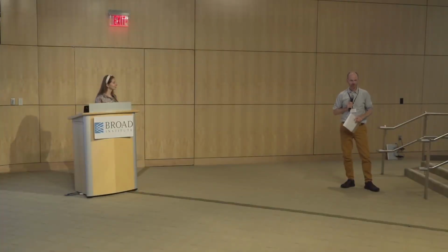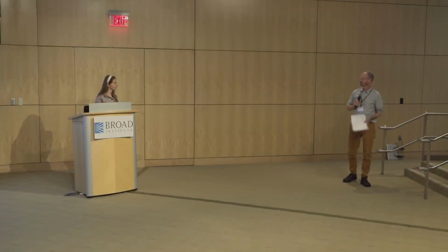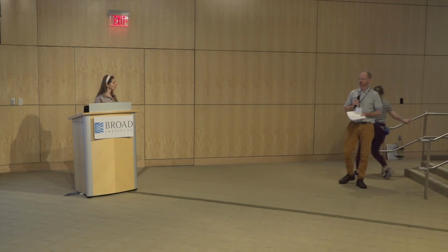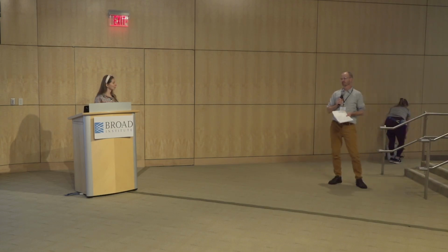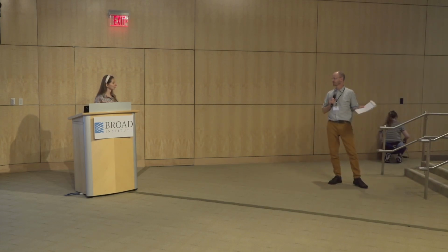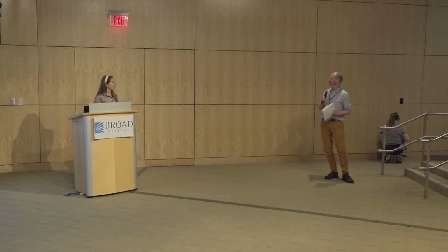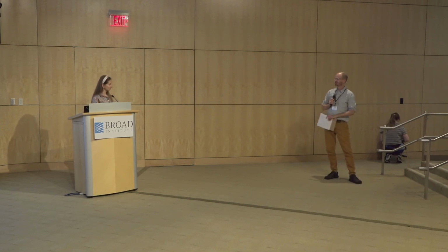So one thing that we're nervous about, since we use lentivirus a lot to deliver libraries in other contexts, we've developed maybe an unhealthy paranoia about lenti, like residual plasmid DNA from the lenti prep creeping into the genomic DNA. Is that a problem that we should be nervous about? Do you see that? And how can we get around that?